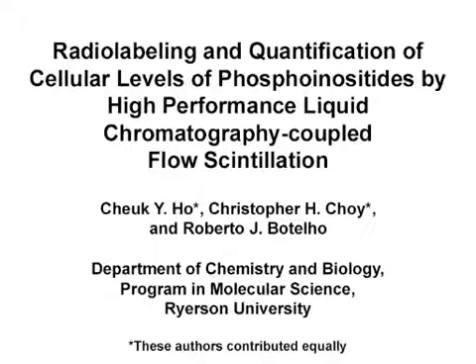The overall goal of this procedure is to measure the amount of each phosphoinositide species in cells under various genetic and environmental conditions in order to understand phosphoinositide function and regulation. Phosphoinositide lipids control cell functions like migration, replication, and membrane trafficking. This method identifies genetic and environmental conditions that impact phosphoinositides and increases our knowledge about their regulation and function.